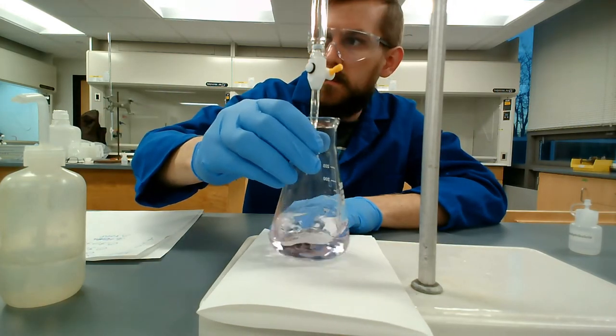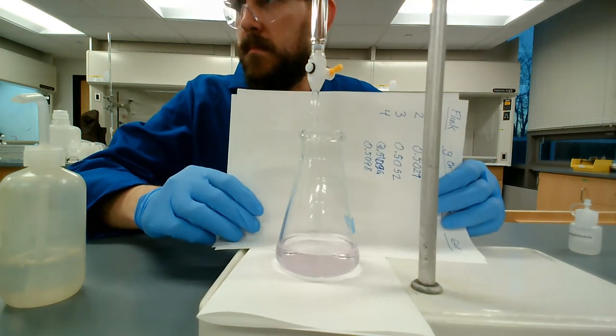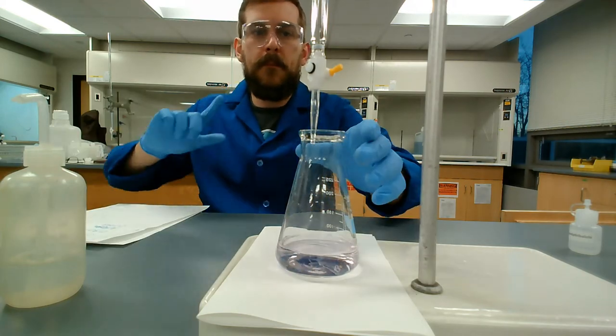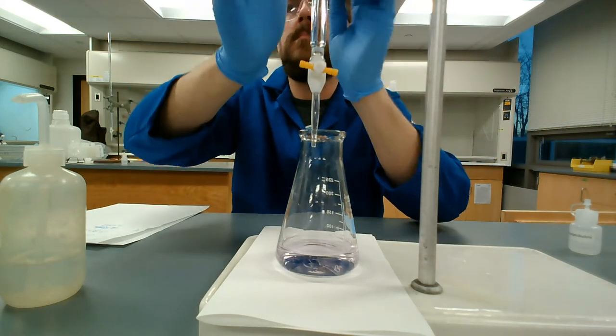So usually the first one's a little bit rough. Now you can see the pink color. Put the piece of paper just to make it a little more obvious, right? That's still very faintly pink, right? That's what we want. We want no color to a very faint pink color, right?